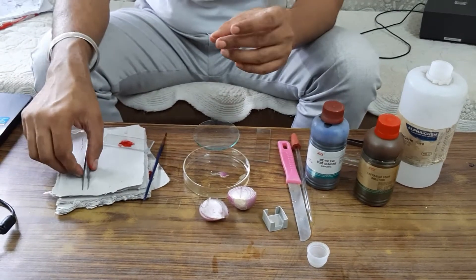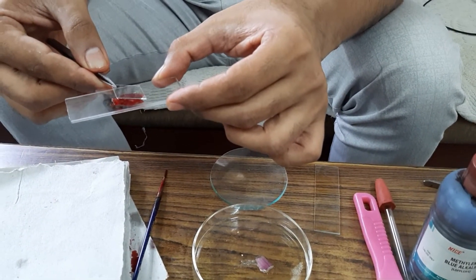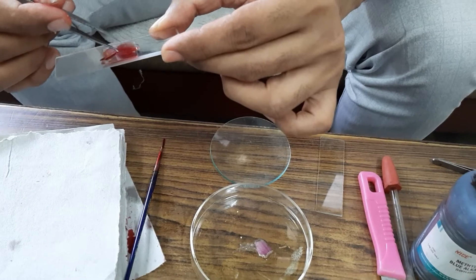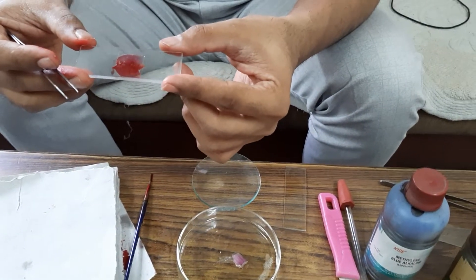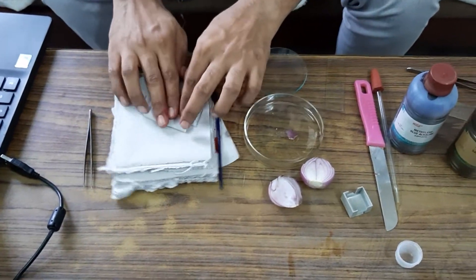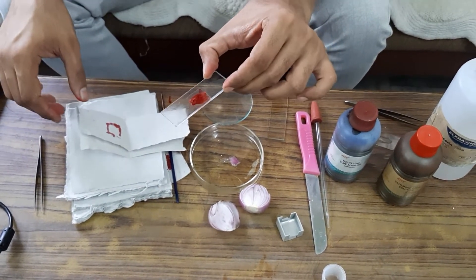Then put the cover slip on the slide. Make sure you are placing the cover slip very carefully, otherwise bubbles may come in the material and obstruct observation under the microscope. Use filter paper to gently press and remove the excess stain and glycerin. Our slide is now ready.